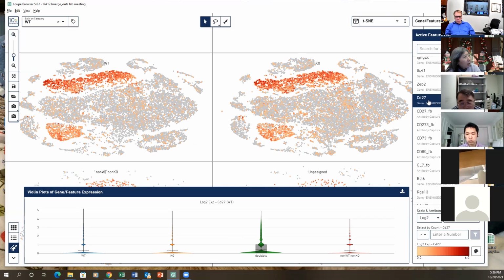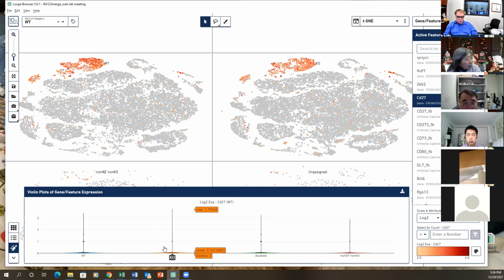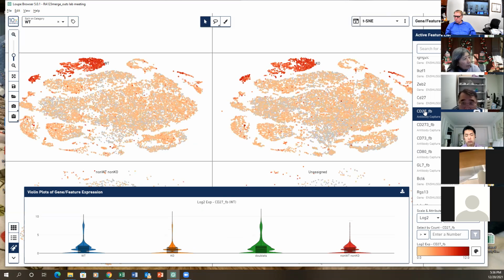is kind of memory. Tricky. This is CD27. I feel the cell number, the gene expression, actually, if we compare the memory cells between two groups, we're still gonna see a lot of genes differentially expressed. And also I think we compare the cell number. Cell number is kind of decreased for knockout. Right, there's definitely more in the wild type here, right? Oh, this is 1.4. That's 1.1 or 1.04.